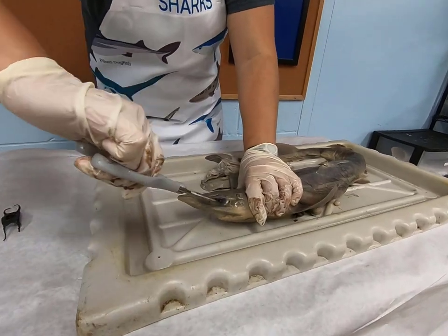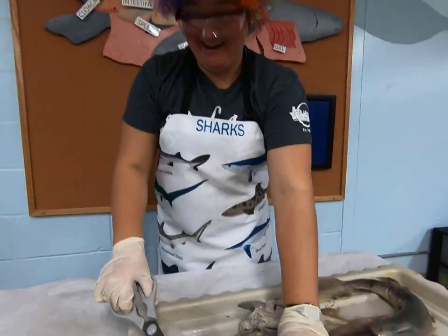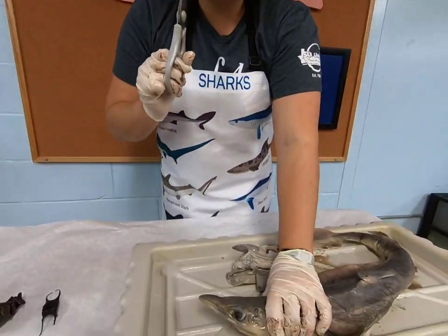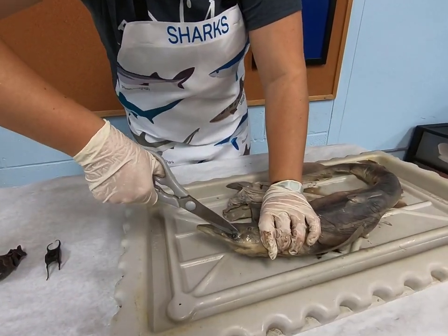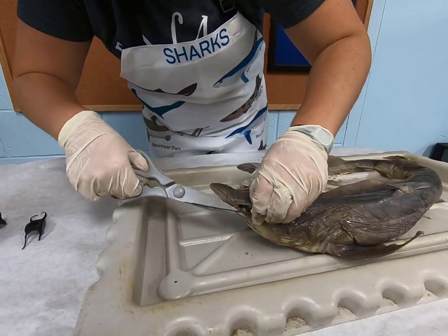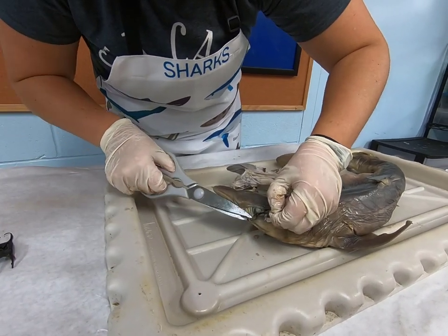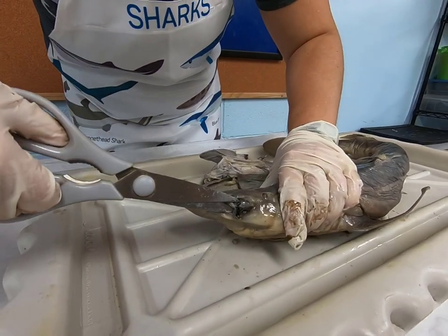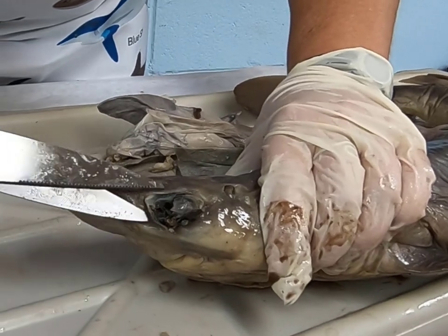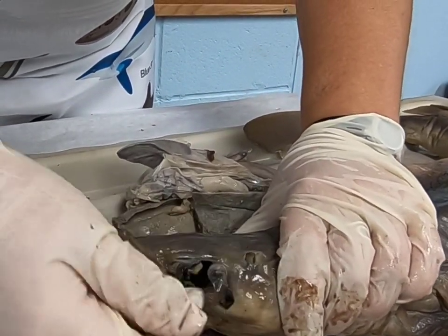See if we get a good splash on this one. Safety goggles, guys. Safety goggles. It went straight up into the air. You can kind of see that tapetum lucidum there in the back of the eye, that silvery layer right there. And let's get that lens out right there.